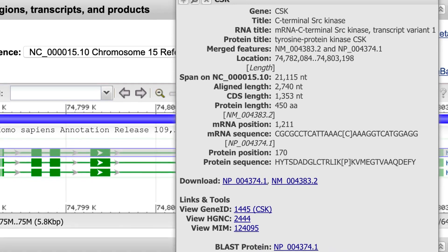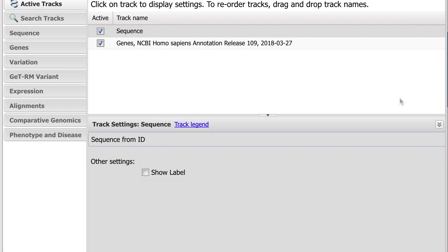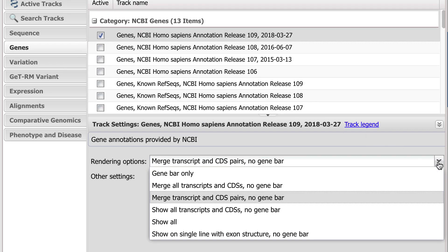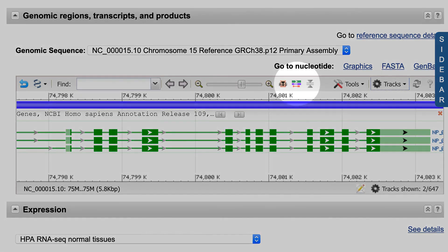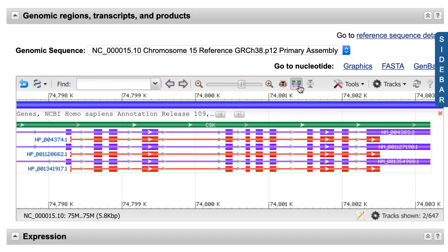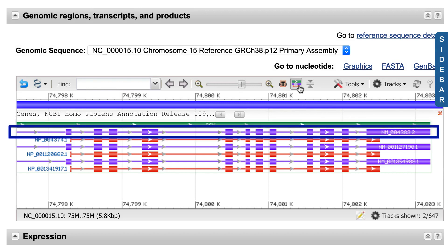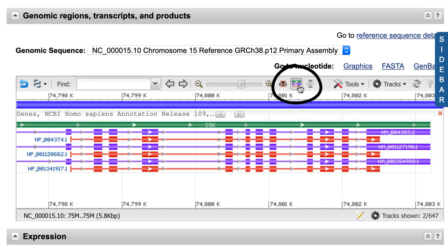Now let's say you want to see all of the RefSeq transcripts and proteins annotated for this gene. You can go into the tracks configure tracks menu and change the settings there, but there is a one-step solution. Just click on the show all icon at the top of the viewer. Now you see the gene bar in green, the purple mRNA transcripts, and the red protein annotations. Note that this is a toggle switch.